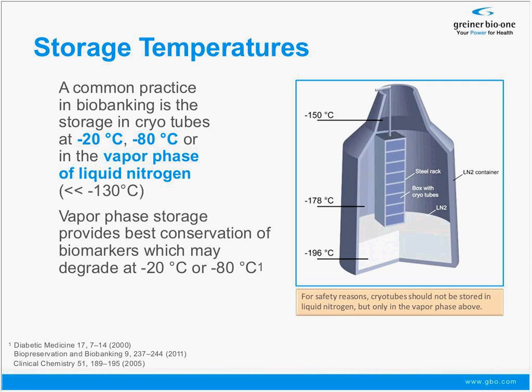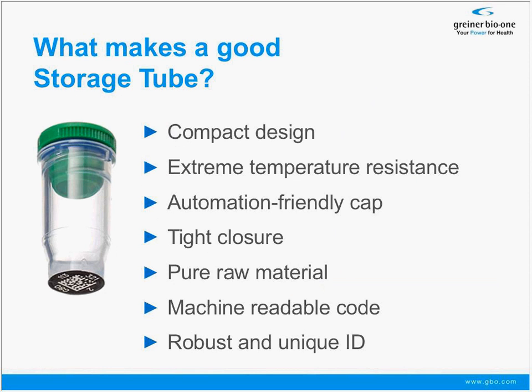So I talked about the challenge of biobanking, the workflow, the things that can go wrong, and the extremely low temperatures that are recommended to store your samples at. This brings us to a slide which lists the requirements we can deduce from everything we have talked about so far, and will lead us to a good biobanking or storage tube.